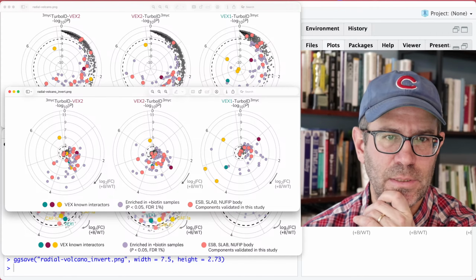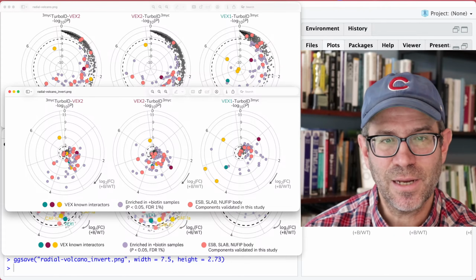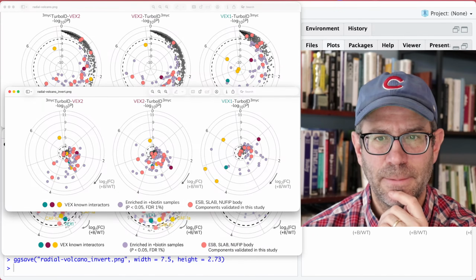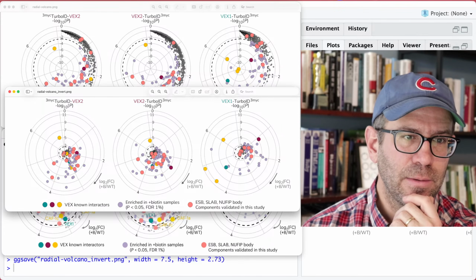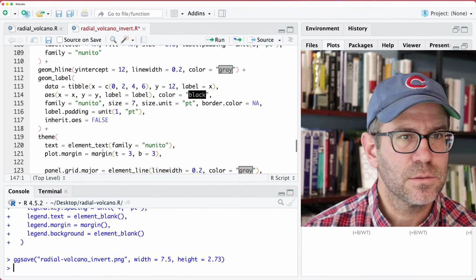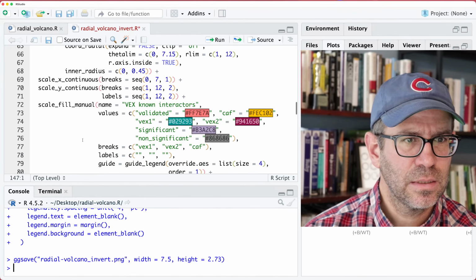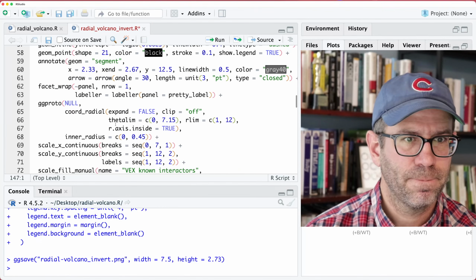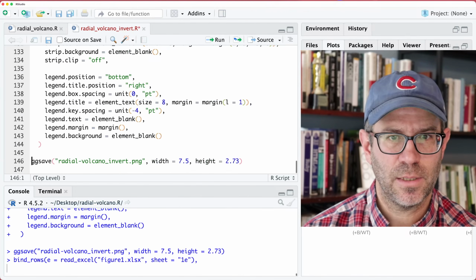So now what we see is that these smaller gray points are at the inside of the circle. They're not significant, right? And maybe we could get a bit more separation on the inside by having it go down to 0. So if we come back up to chord radial, I think, oh, and that was with the GG Proto weirdness. Let's put a 0 in there.